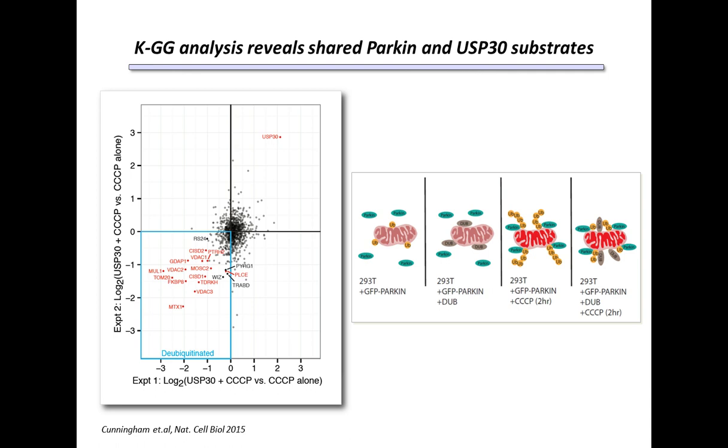Now, a key question within the ubiquitin field and many of the biology areas that it impacts involves identifying the substrates of E3 ubiquitin ligases and deubiquitinating enzymes. And one area where we've used KGG profiling to great lengths is to understand the substrates of the E3 ligase parkin, as well as the deubiquitinase USP30. And this is some work that's been done across a couple of studies in close collaboration with Baris Bingol and others.